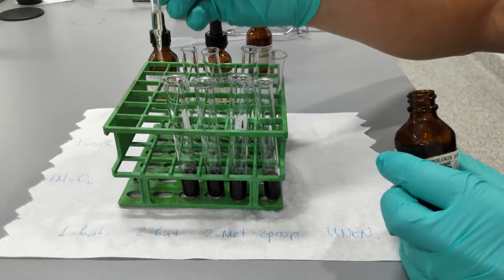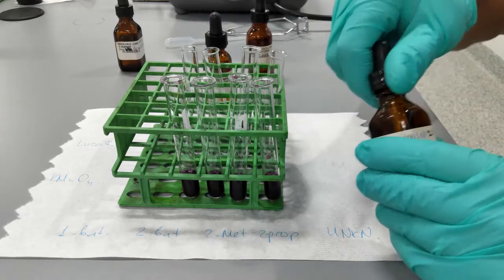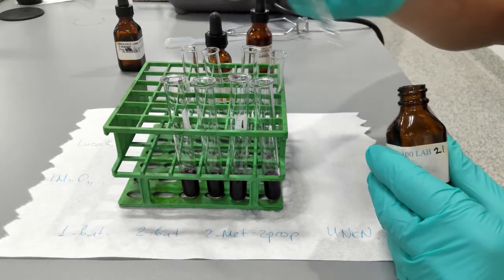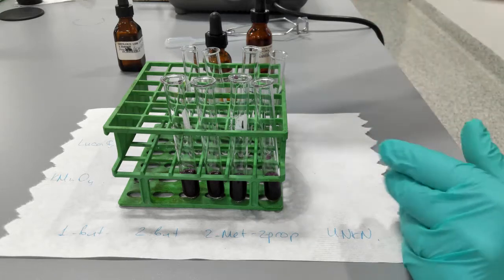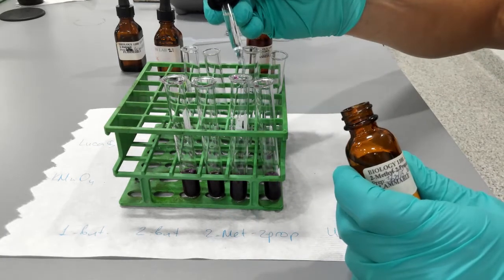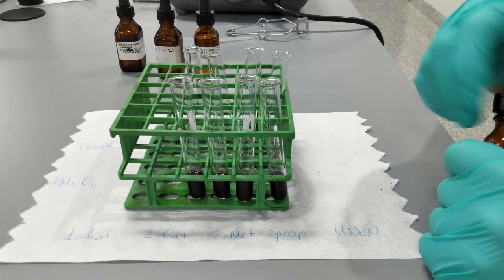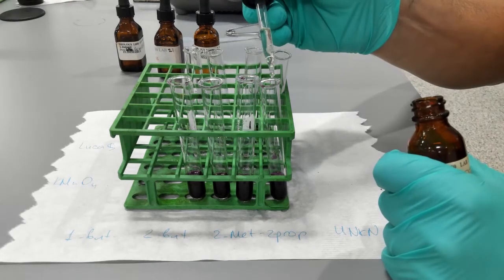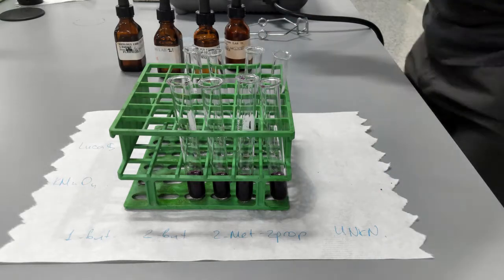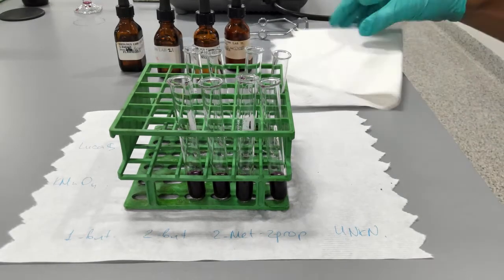So I add 2 drops of 1-butanol in tube 1, 2 drops of 2-butanol into tube 2, 2 drops of 2-methyl-2-propanol in tube 3, and 2 drops of unknown in tube 4. And now I start mixing the tubes.